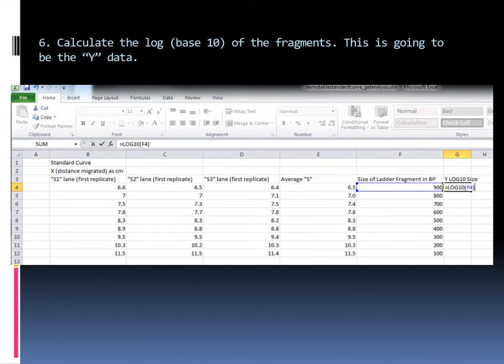Now in Excel, we also entered the size of the ladder or molecular weight standards in a column. And that column is over here. So those standards ranged from 900 base pairs to 100 base pairs. Now that's not the data we want to use for graphing, because the relationship between migration distance and the size of a DNA fragment is a logarithmic relationship. So what we're actually going to want in terms of Y data is the log to the base 10 of the size of the ladder fragment in base pairs. And the way to do that is shown here. This is the calculation in Excel. You type in equals log 10, and then in brackets you choose the cell that you want to have as your input data, close the bracket, and hit return.